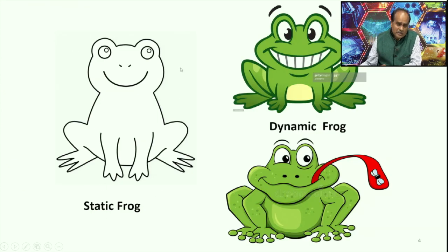So, if you solve a structure mostly by crystallography, you see something like a static frog, but a frog is never like that all the time, it is not static, it has subtle dynamics. And when it does dynamics, like putting out its tongue to catch a fly, that happens for a fraction of a second, but that putting out of the tongue is very important for the function of a frog.